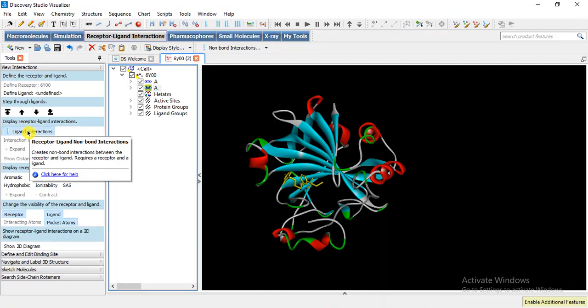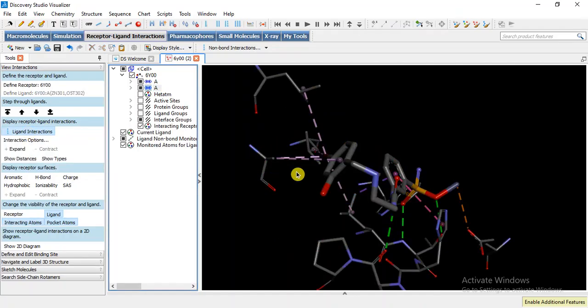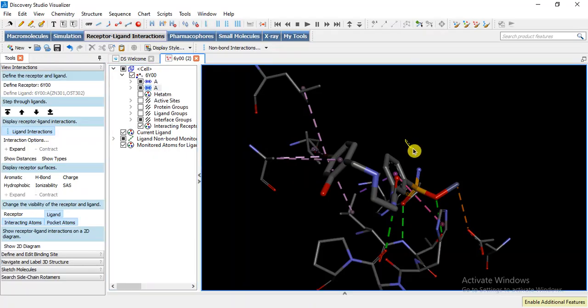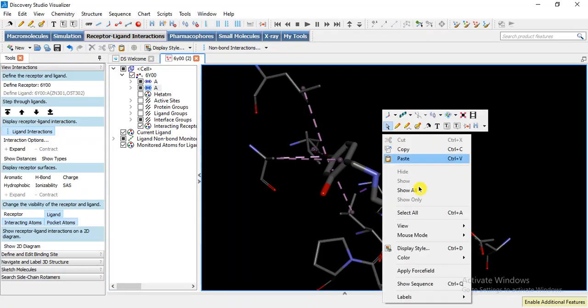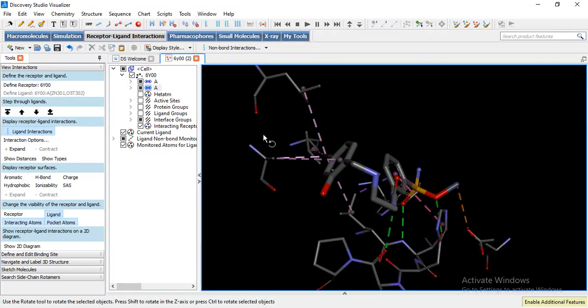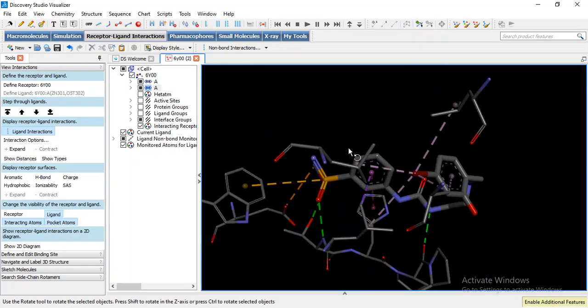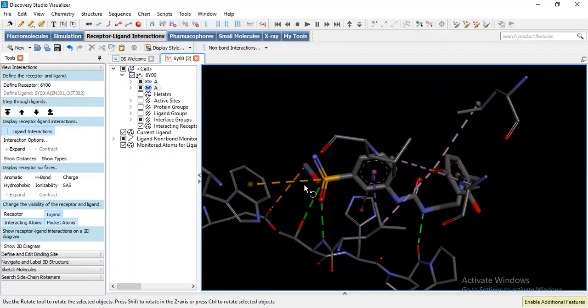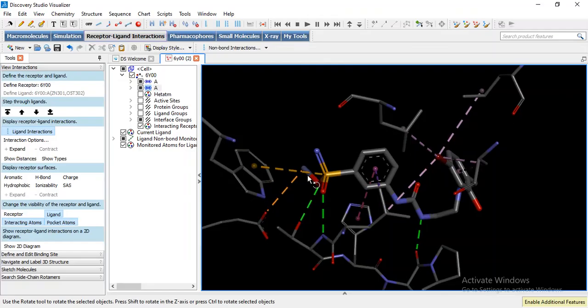So by clicking here we will observe that ligand target interaction. Now I am going to change mouse mode into rotate. This is our interaction of the ligand.